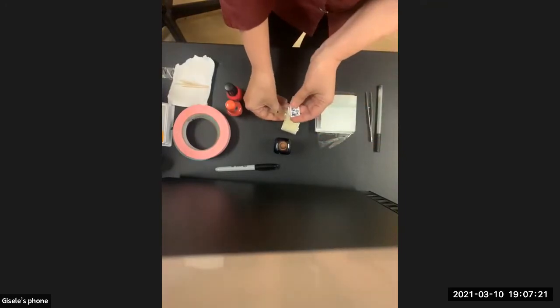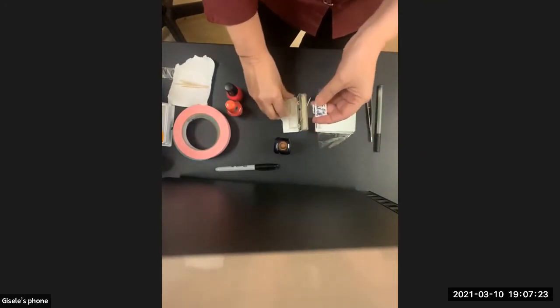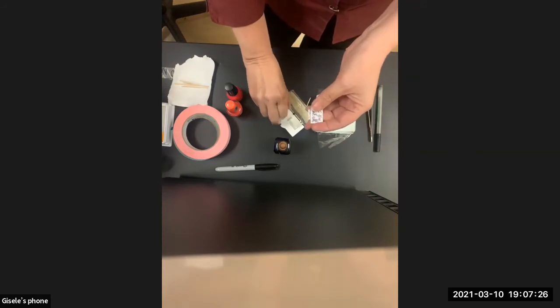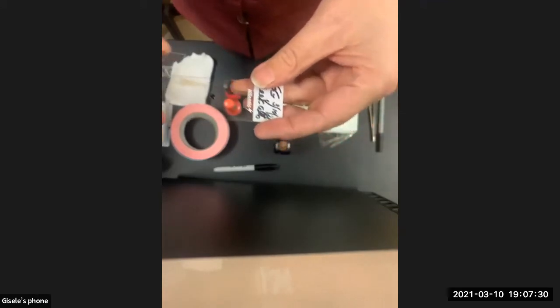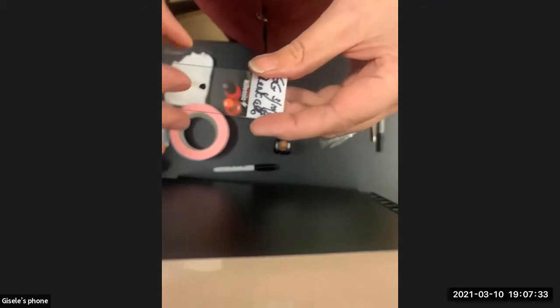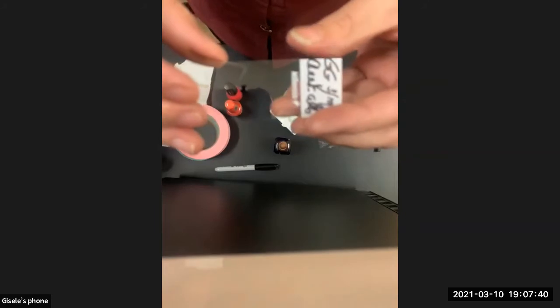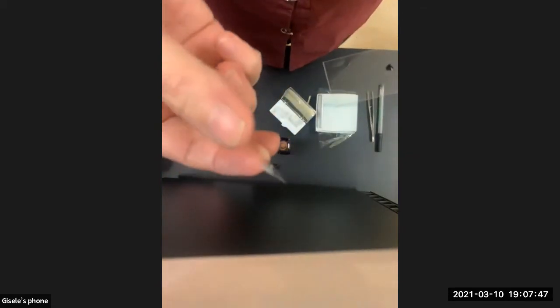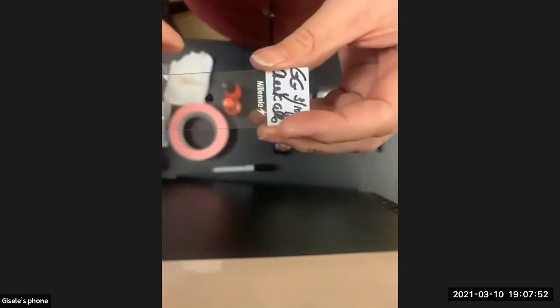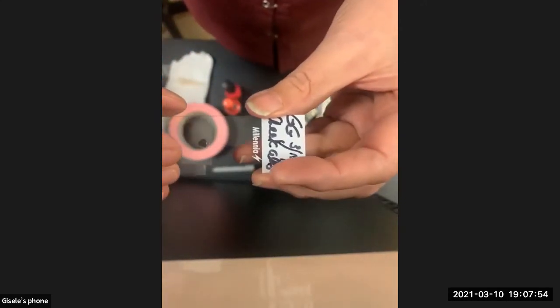This is really the thing I want to show you most, to be honest. So cover slips, as a microscopist, we're kind of perpetually in love with cover slips. First of all, these are not reusable. Never wash a cover slip. When you're done, either the whole thing goes into glass waste, or you take the cover slip off and reuse the slide, but you never reuse cover slips. Look how tiny they are. It's too easy to cut yourself, or they're just fragile. So don't reuse cover slips.